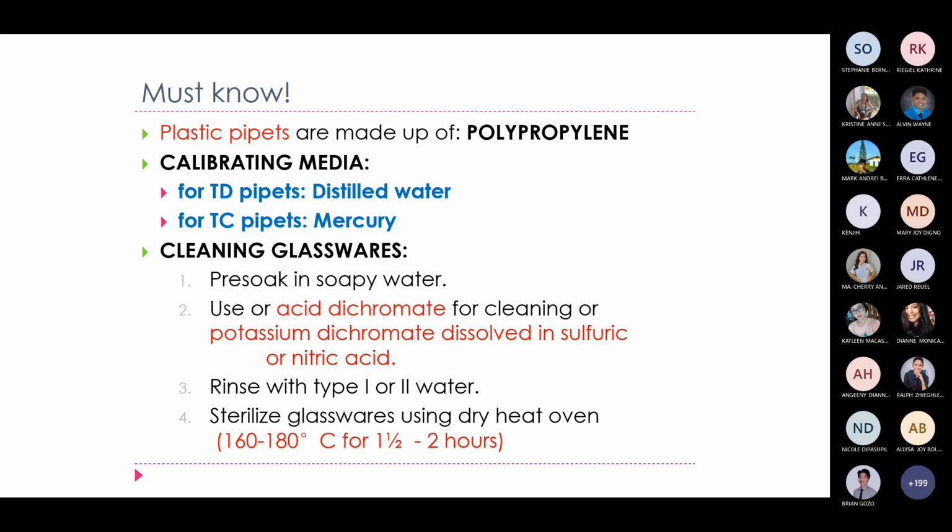O reviewin nga natin yung mga types of reagent water natin. For type 1, sa tingin nyo, ano yung pinaka-pure dito sa tatlo? Anong pinaka-pure na water? Type 1. Okay. The type 1 water, it has the maximum water purity. Saan siya ginagamit?